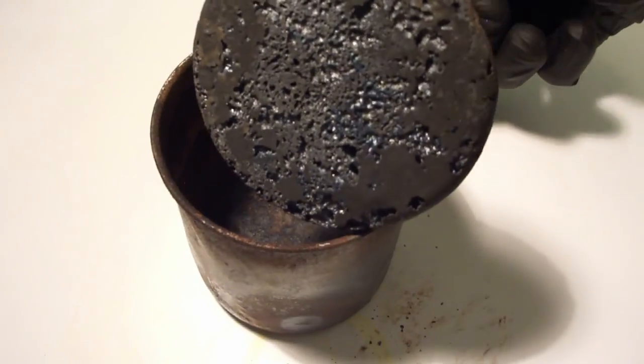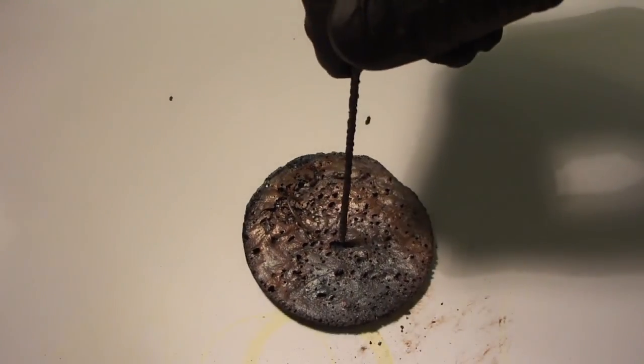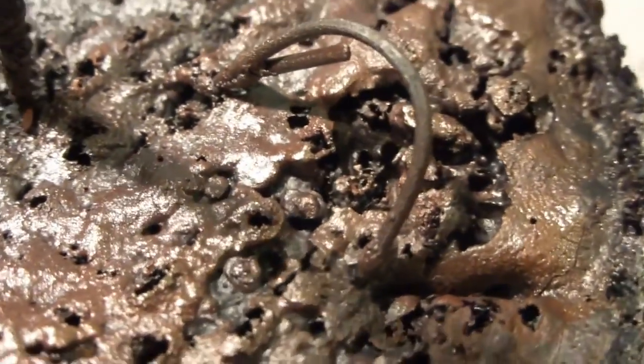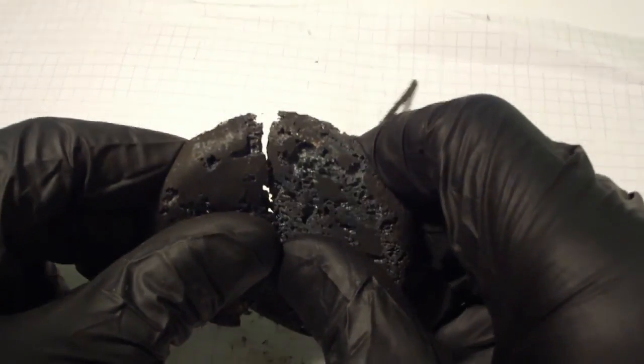This is how the iron sulfide looks like. It can be easily broken up and pulverized. We think that it looks like a tasty chocolate cake. It actually has the consistency of a freshly baked cookie when you break it.